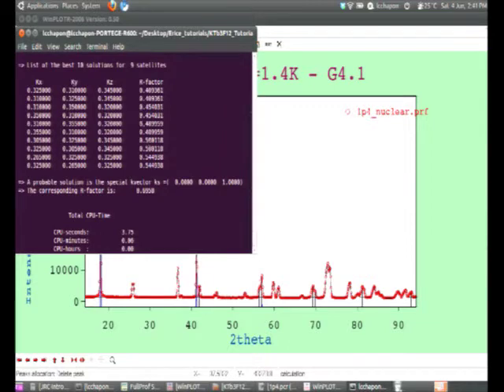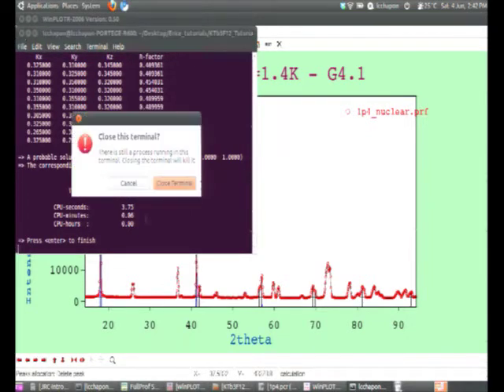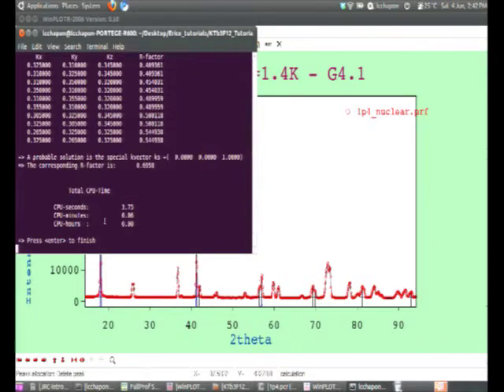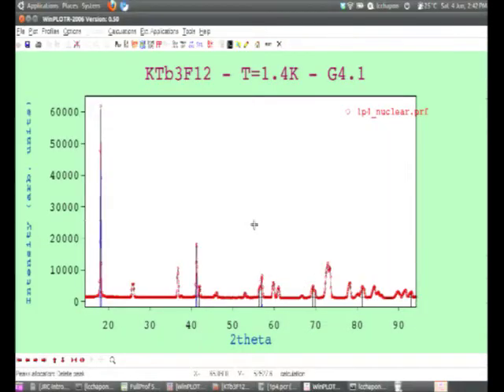And of course, it will always find, in this case, incommensurate propagation vectors, especially small ones, because it will index everything. But it's still quite clever. For example, it tells us in this case that it's probably a special k vector, which is 001. And actually, that's the right one in this particular example. You can do exactly the same thing as I did there with all the peaks, not just the satellites, and then invoke ITO and TREOR and so on.